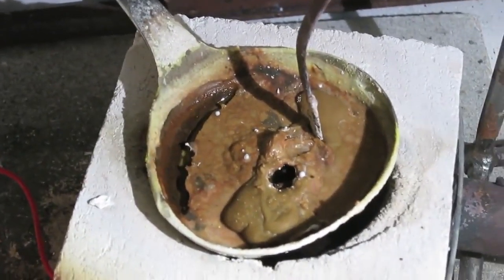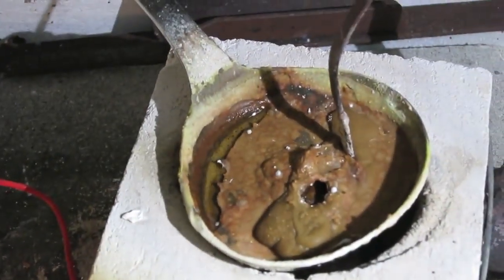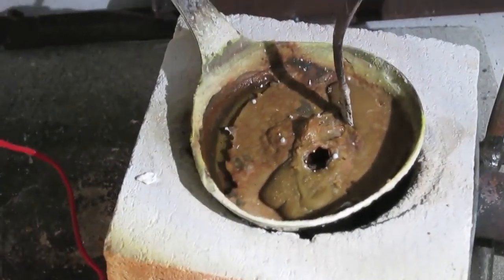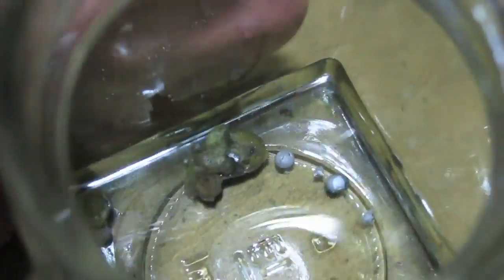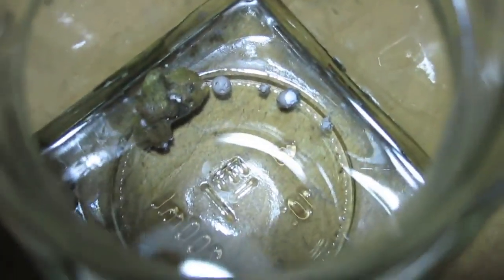There's another one forming. I think I should turn off the flame, otherwise it gets too hot. You still have to find a way to separate the sodium metal from the melt. So this is the first yield — a small amount of lamp oil and you can see small pieces of sodium metal in it. This is still frozen NaOH with a little bit of iron oxide mixed in.